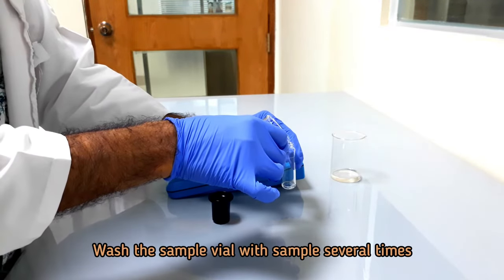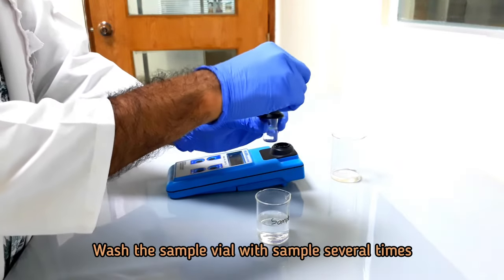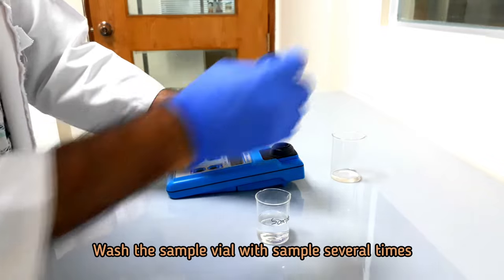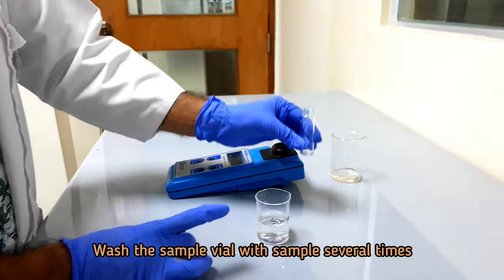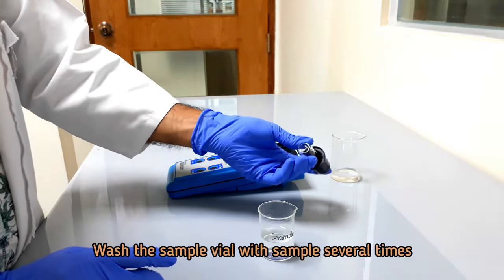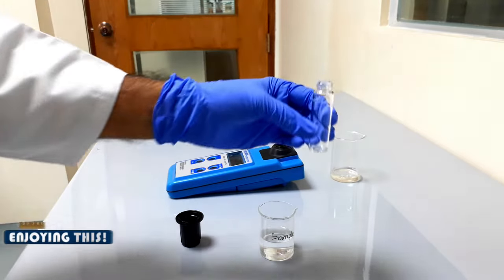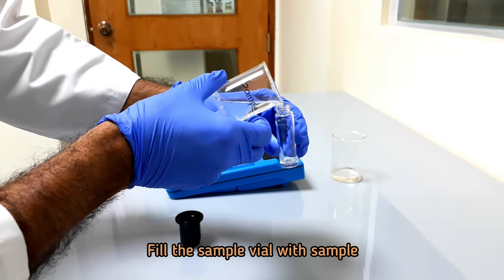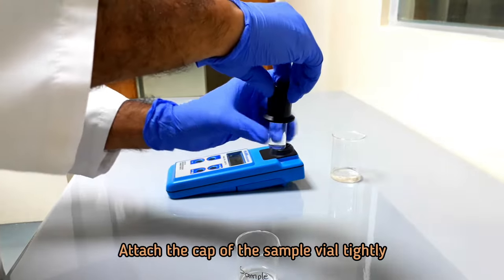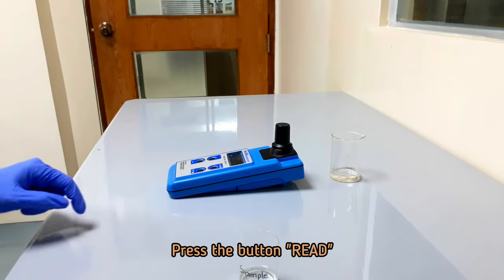Wash the sample vial with sample several times. Fill the sample vial with sample. Attach the cap of the sample vial tightly. Insert the sample vial into the holder of the turbidity meter. Press the button read.